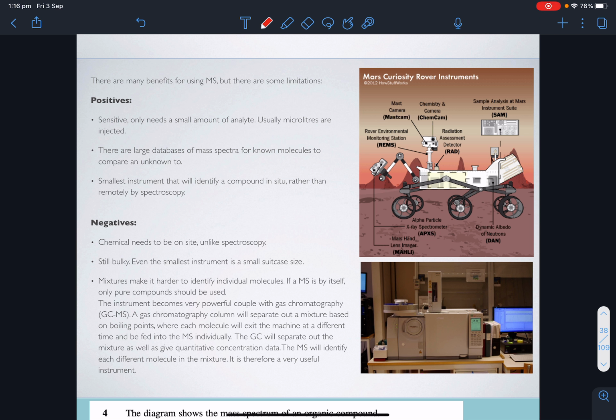Another good hint, though, is these mass spectrometers are linked to computers, and the computers are the readout. They're also linked to very large databases of previous mass spectra. And so these computer programs make predictions and compare them to mass spectra, so they can pretty much identify it for you. Now, it's still a really good skill as a student to work out how these work as well, because when problems happen, you can't always rely on that program to help you out.